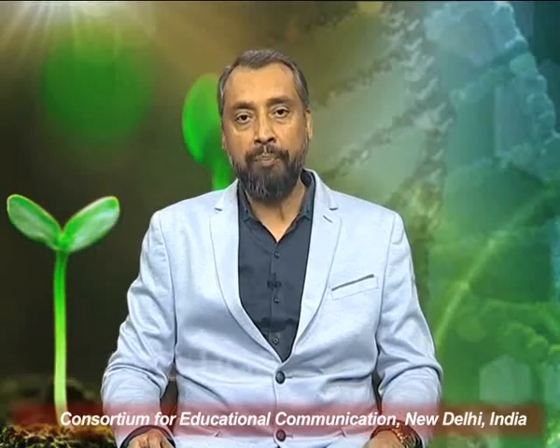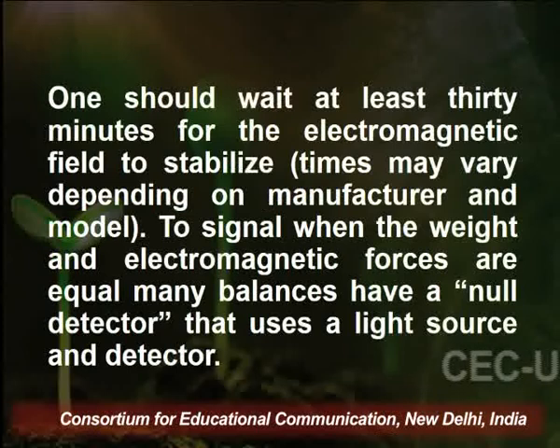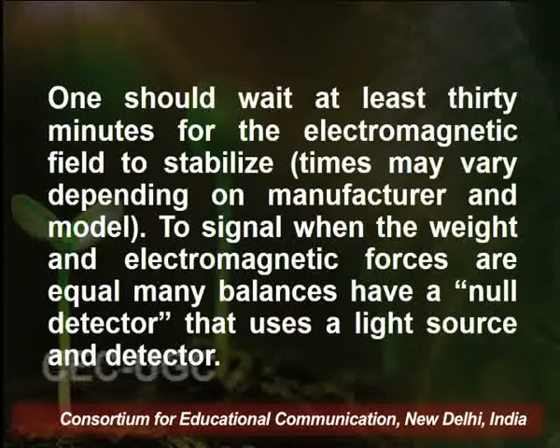One should wait at least 30 minutes for the electromagnetic field to stabilize before starting to work on an analytical balance. This time of 30 minutes may vary depending upon the manufacturer and the model of analytical balance which we are using.